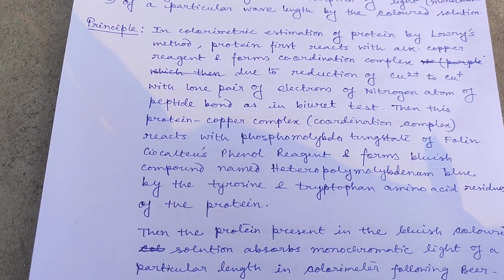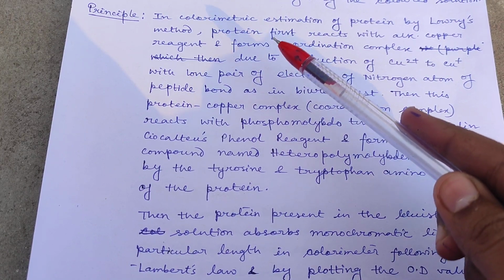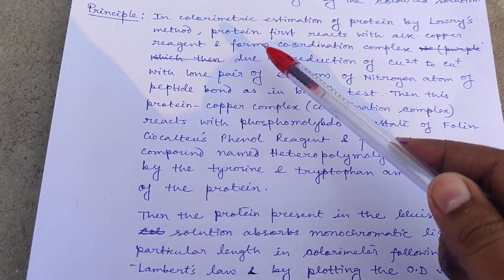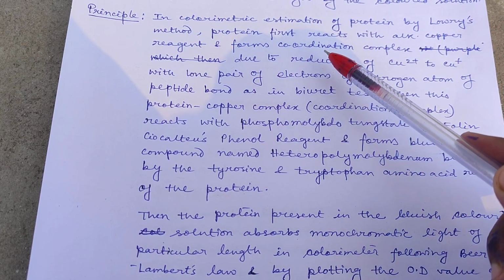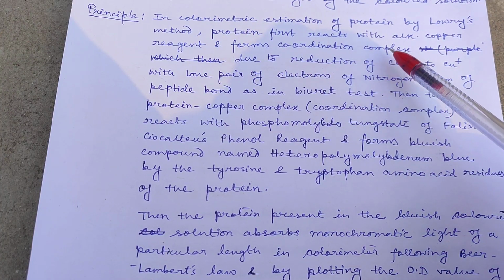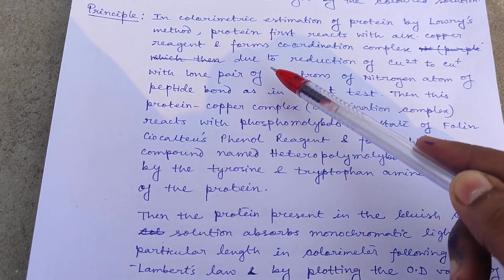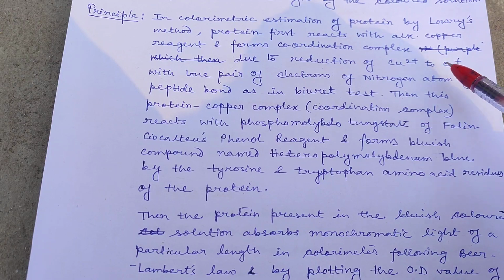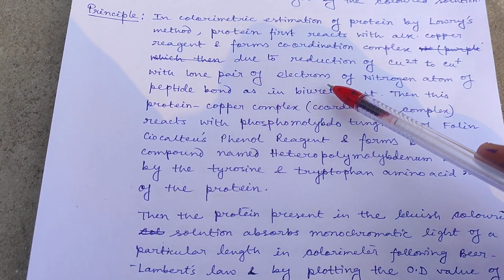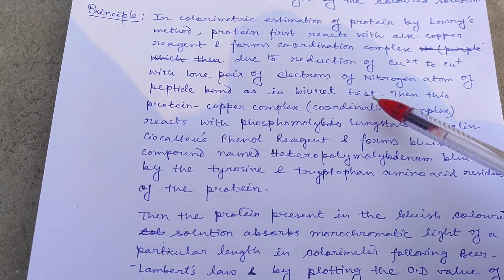So in colorimetric estimation of protein by Lowry's method, there are two reactions. First, protein reacts with alkaline copper reagent and forms a coordination complex, also known as protein copper complex. How do they form? Due to the reduction of Cu2+ ion to Cu+ ion with the lone pair of electrons of nitrogen atom of the peptide bond, as in biuret test.